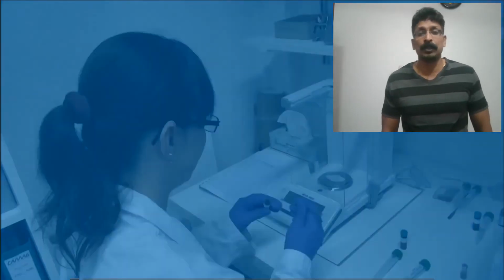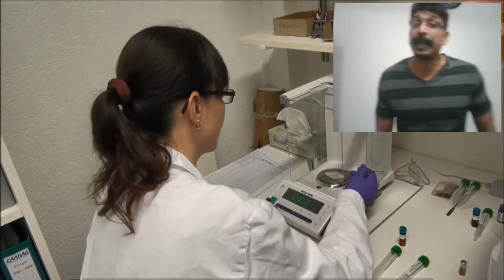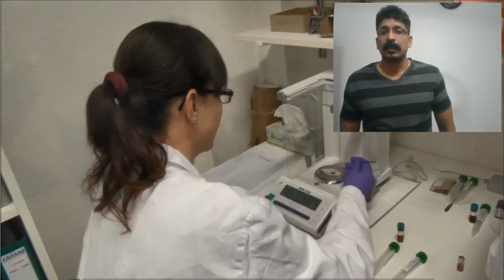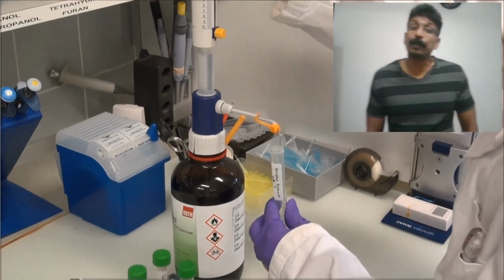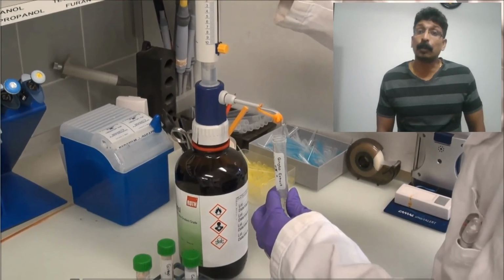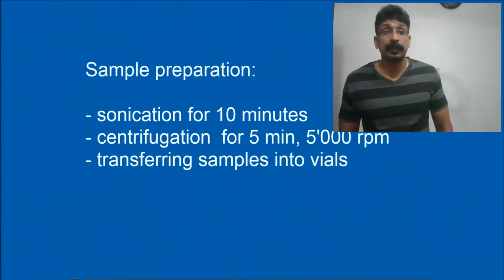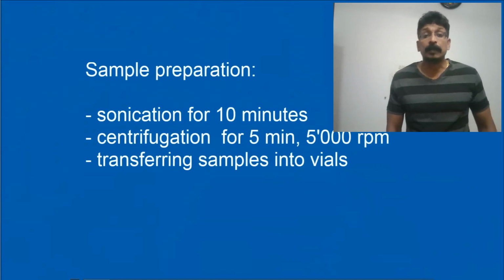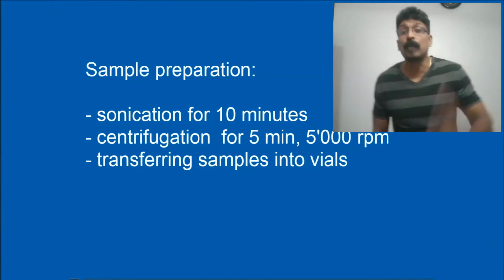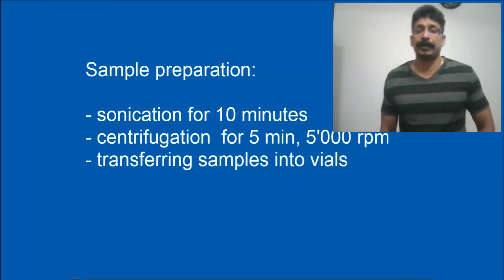You see the madam is just preparing a sample. She's weighing in a digital balance, taking 100 milligram, and diluting with methanol, you see high grade methanol, ginkgo extract. And how is she going to prepare the sample, you see? Here, very important, listen. Why I am putting pause is that you should know what is going on there, because simply if you watch a video, it has no meaning. Sample preparation, what are the things needed?